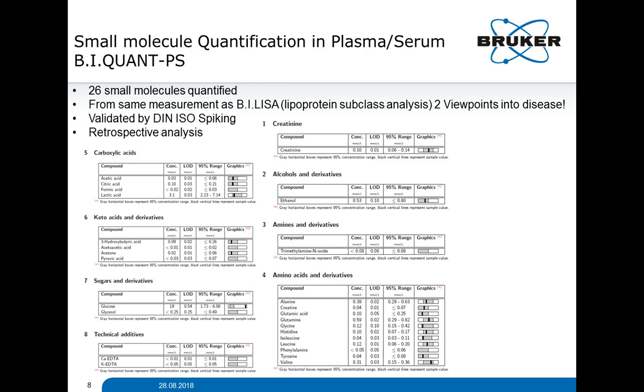Now I will show you a report. This is the small molecule quantification. You can see here the components, and you can see that we have a large variety of chemical classes that are analyzed with one single experiment, which conventionally might take more than 1 or 2 methods. And you also see here, when we look at this gray bar, that this is a normal concentration that we get from our reference cohorts. And the black bar is the person itself, so you always know if that person is within the reference range from our models or not.